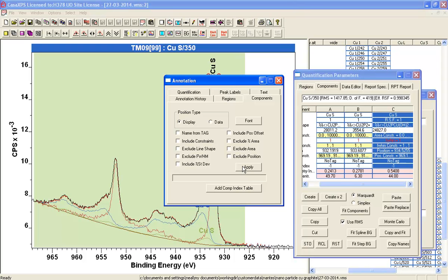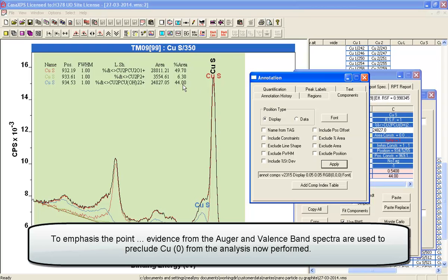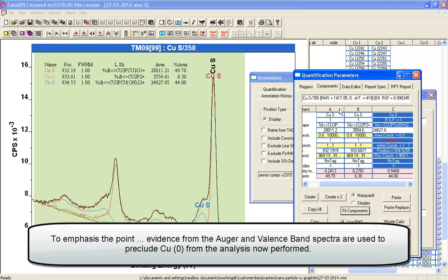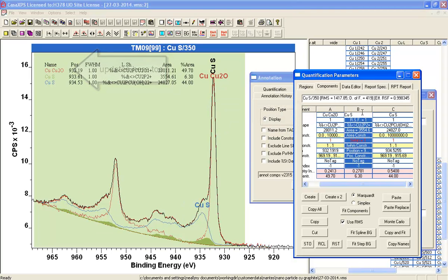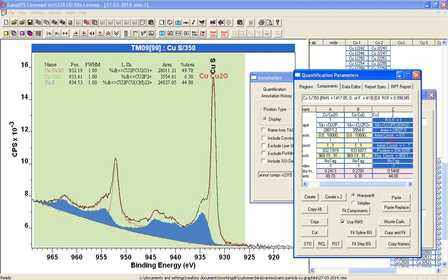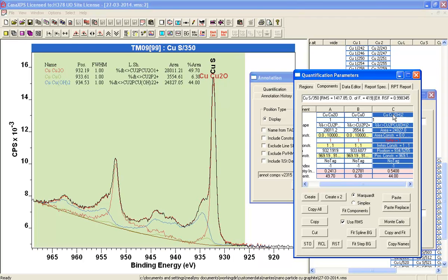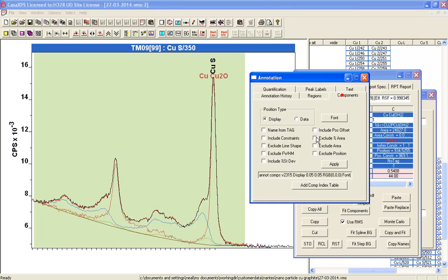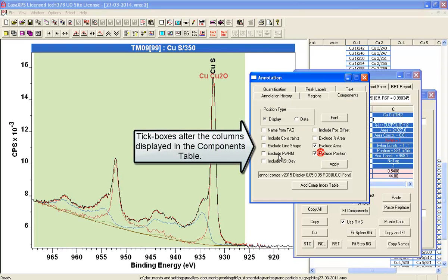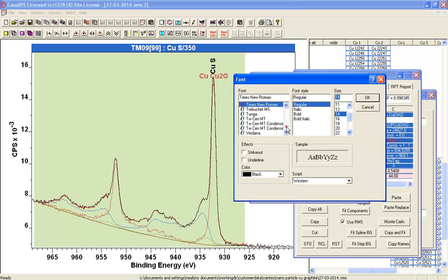If I show you the components table on the annotation, we can now see, and let's label these correctly, so that was the 1 plus Cu2O. This was the copper oxide CuO, and then we have a 2 plus hydroxide. I'll just delete this, and we'll remove some of the unnecessary information. I'll also increase and change the font.